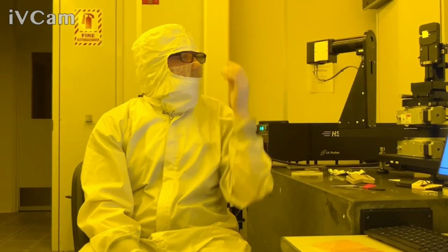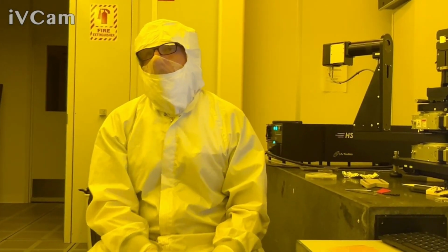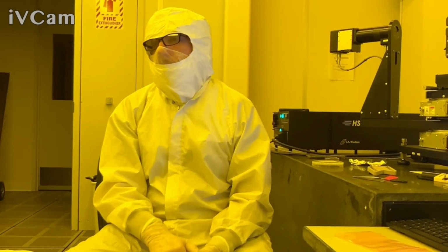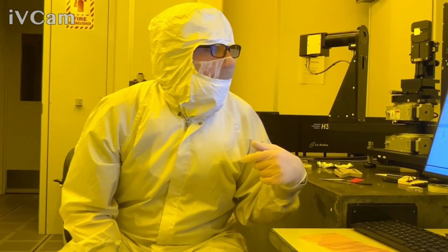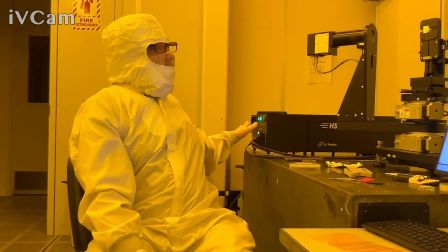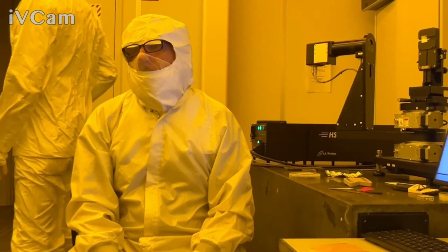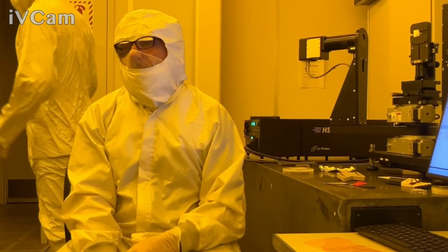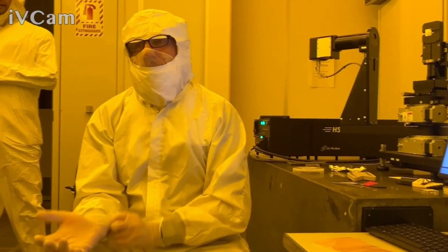So in general, everything is going through the Isobar plug strip. Hopefully that helps. If you know you're going to have a planned outage, you can always just make sure to shut everything down. Shut down the software, then turn off the power to the boxes. Or if you know you're going to have a glitch, the boxes aren't on when that surge comes. It should be fine in general.